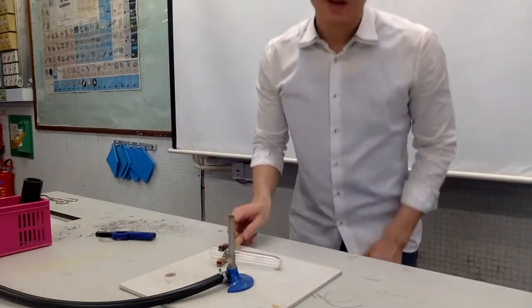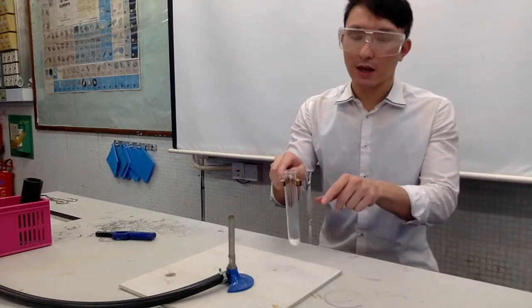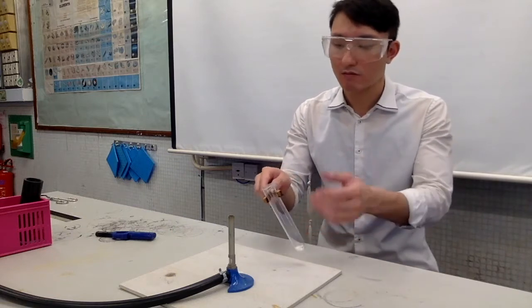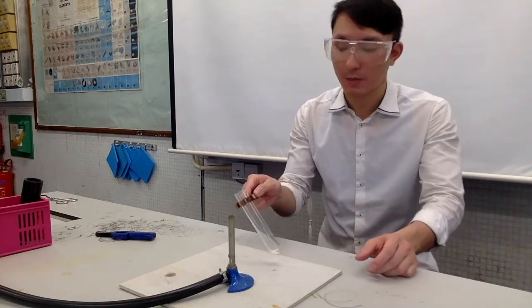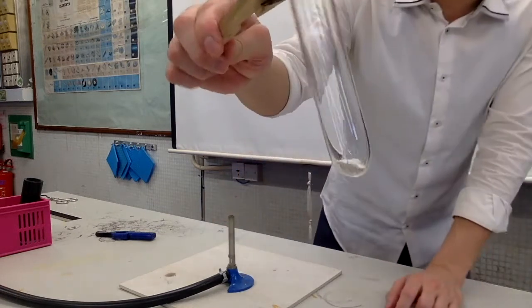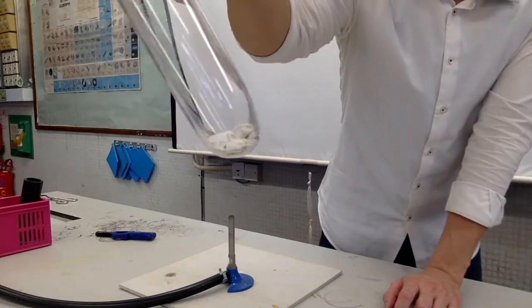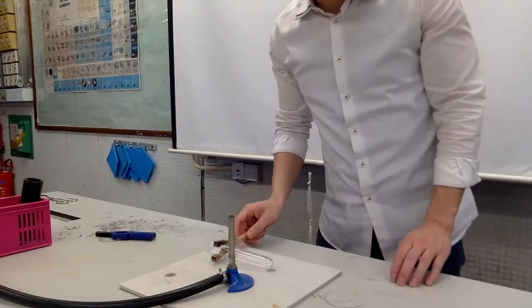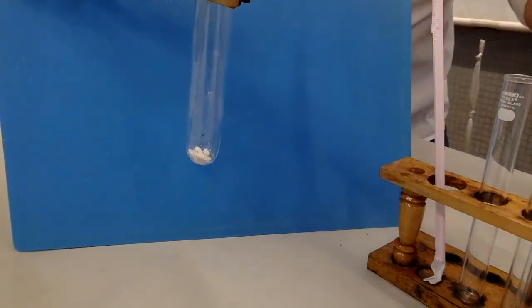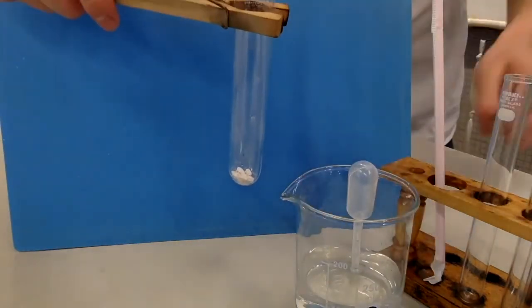The next step is to add water to this calcium oxide. Of course, we need to wait until it cools down, otherwise you may crack the very hot boiling tube. After heating, you can see it is still a white solid. Let it cool down for a while. Now I think it has cooled down, so we are going to add some water to the calcium oxide and see what happens.